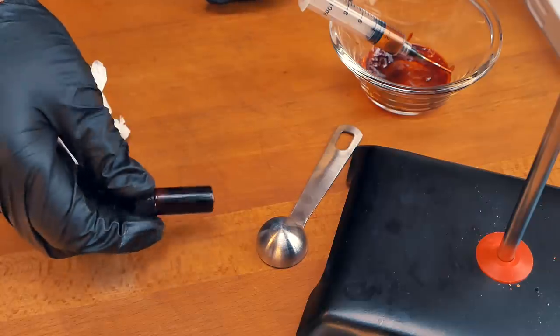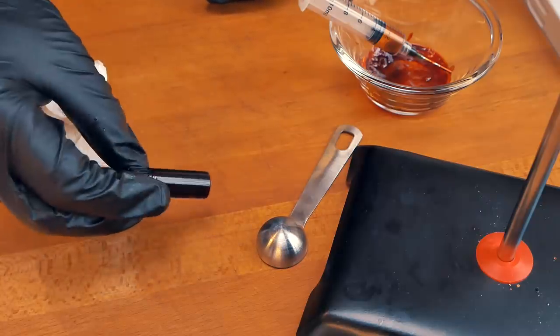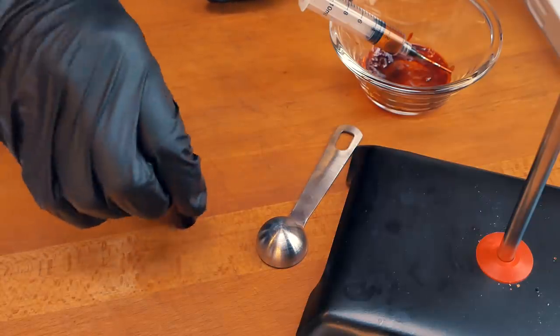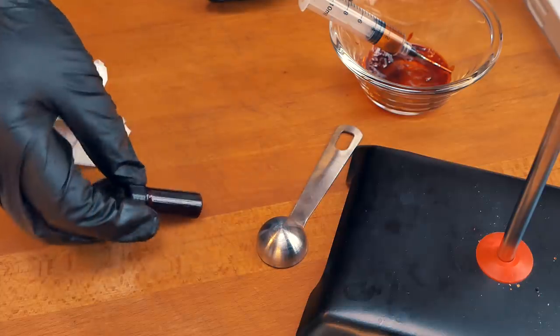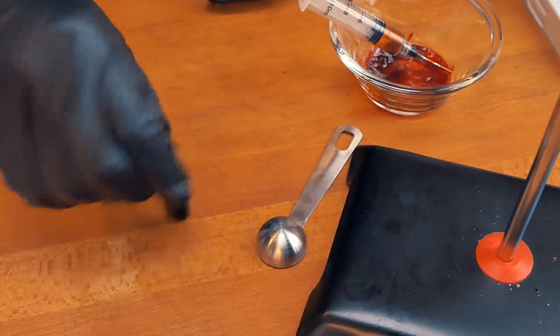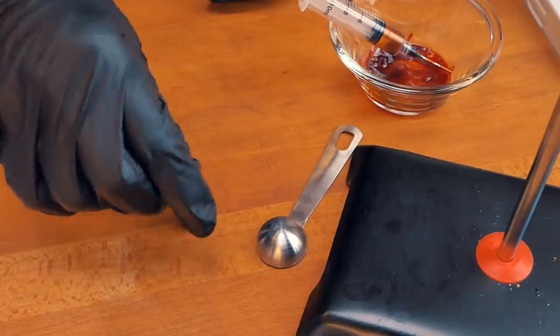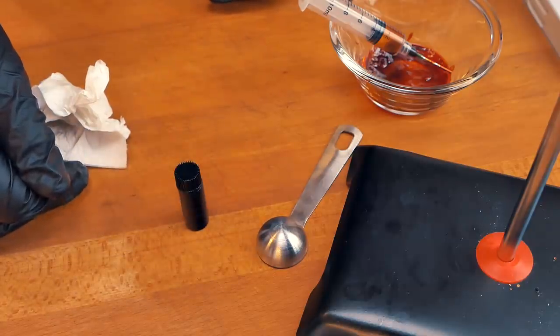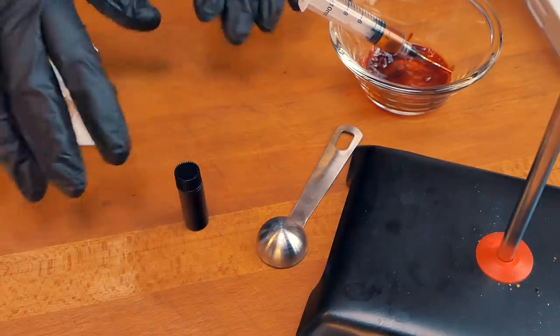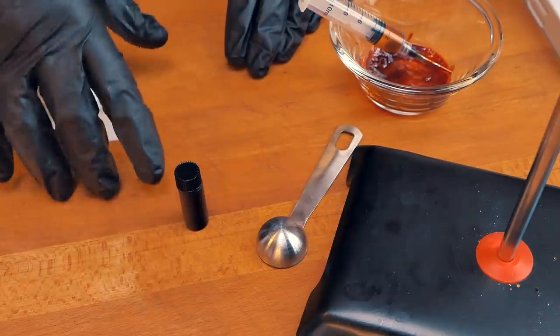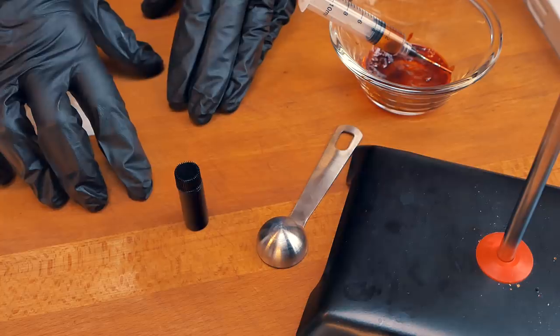So we finished bottling our capsaicin. This is from 20 grams of dried scorpion pods. And yeah, this stuff is really dangerous. Honestly, if you are doing this, don't underestimate just how painful this stuff is going to be.